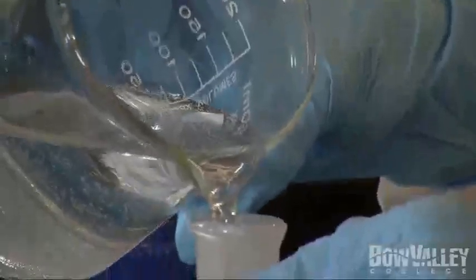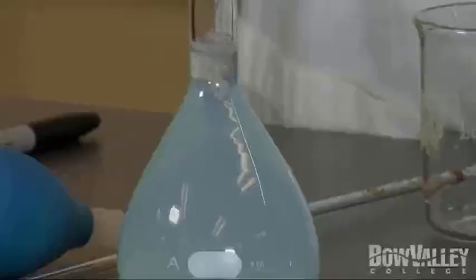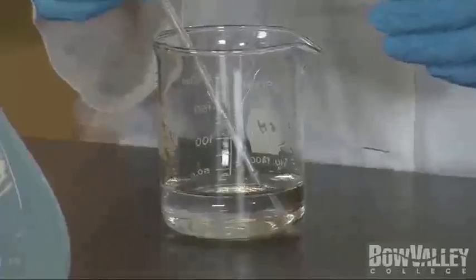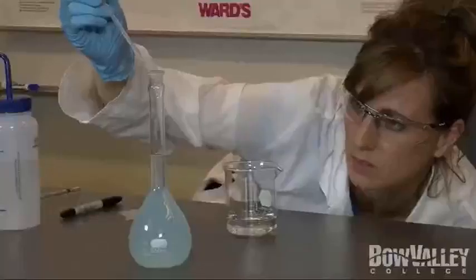Using the same procedure as before, we now add distilled water to the flask, monitoring the level and using a disposable pipette for the last few drops. Once again, the bottom of the meniscus should be sitting on top of the line marked on the neck of the flask.